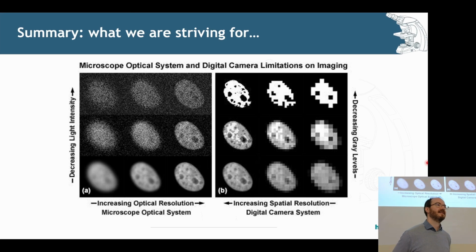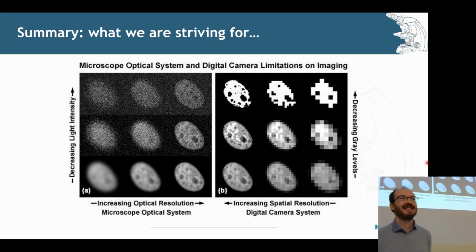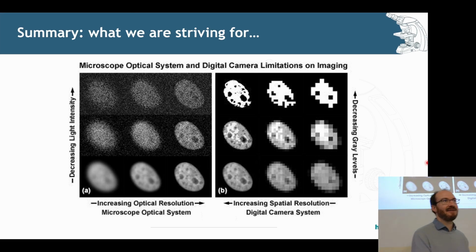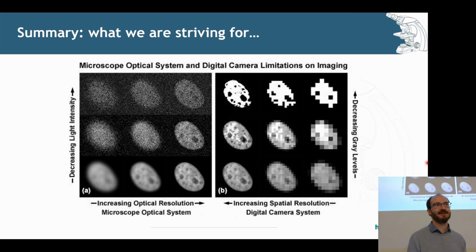Yes, definitely. So if you can capture at 16-bit instead of 12-bit or 8-bit, it will definitely solve that problem. But it's only necessary if it is really low intensities, because the more bit depth, the larger the image is, and then suddenly, where it took 5 gigabytes for one image, now it's, I don't know, 15 gigabytes for one image. So it's always that trade-off.